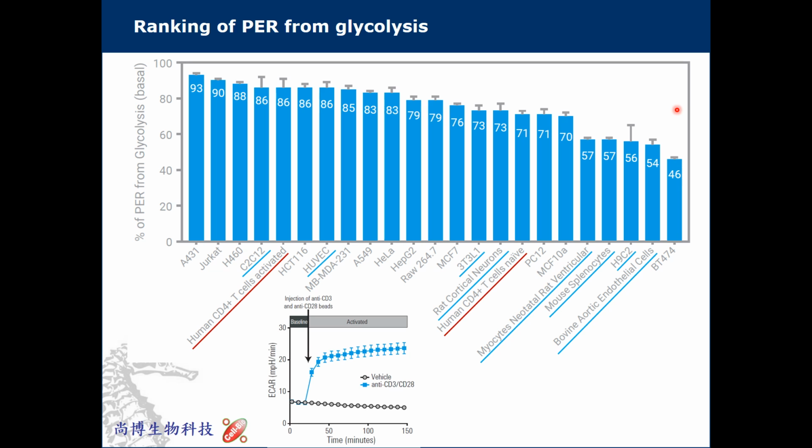If you are comparing more than 2 different cell lines, then you may have different mitochondrial acidification, so I suggest you do the glycolytic rate assay. It depends on whether you have just one cell model or more than 2 cell models that you need to compare with each other. So that is the suggestion for choosing your glycolysis assay.